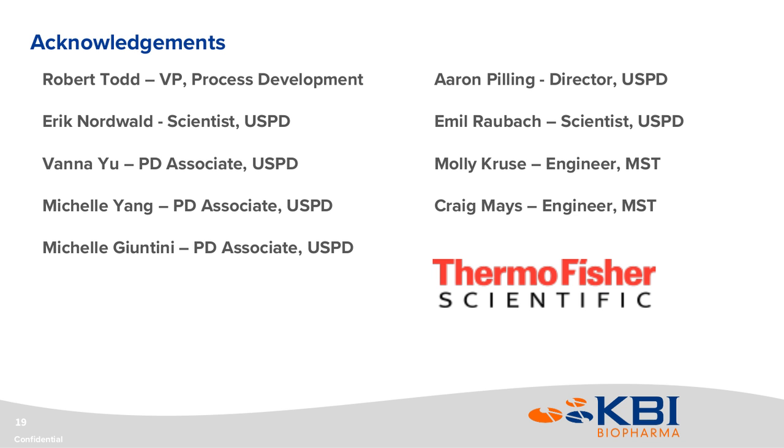The success rate, I would say, has increased due to the limited operations around the fermentations. We can truly focus on the fermentation process as a whole, as opposed to getting too wrapped up with resources focused on those supporting activities. Currently we're limited by OTR capabilities of the SUF, and we reach a little lower cell densities as compared to our stainless systems. With those lower cell densities, we see a slight decrease in titer, but no noticeable effects to product quality so far.